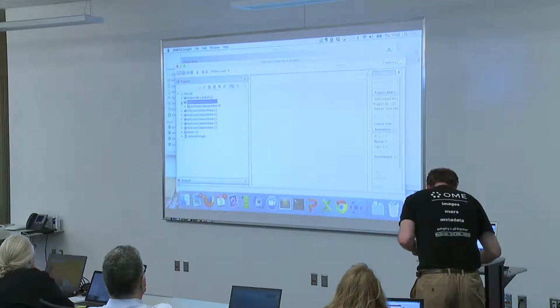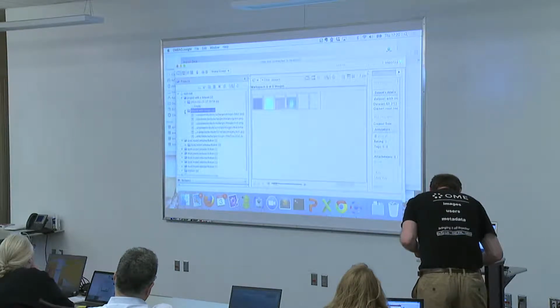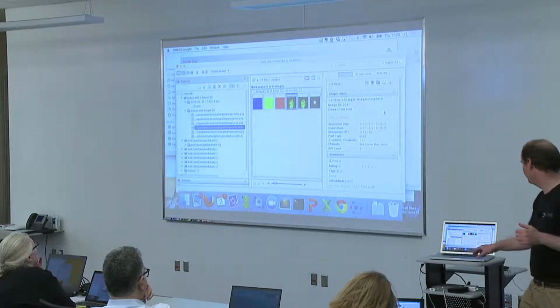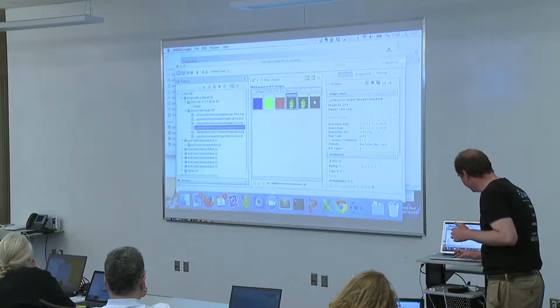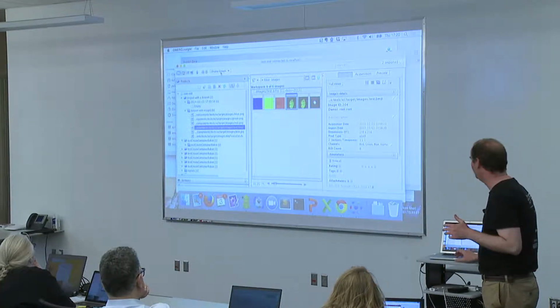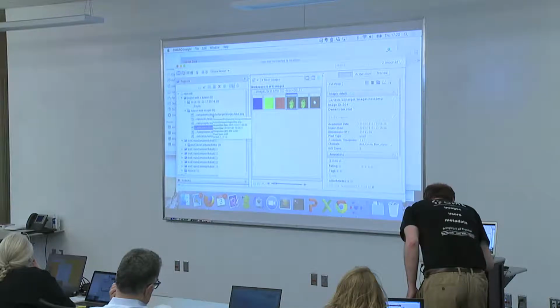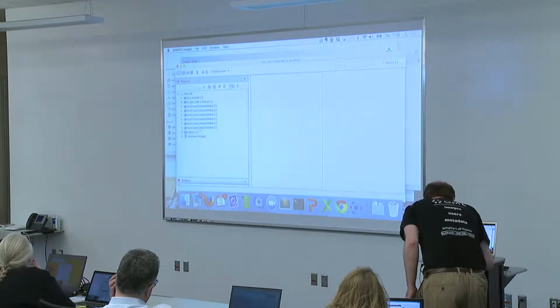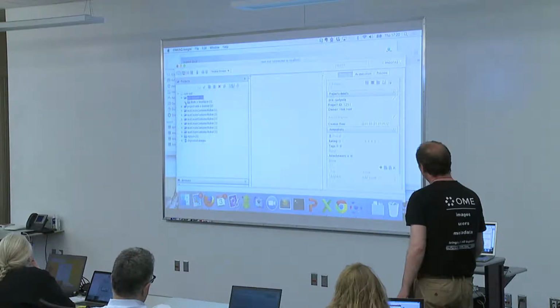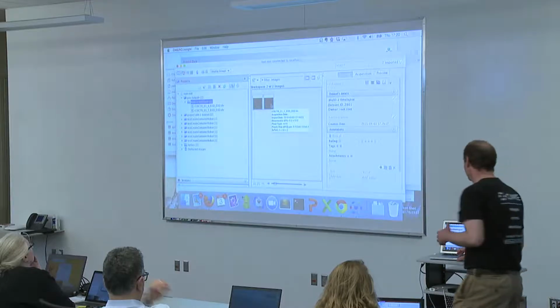If I, for example, go to an image, the basic metadata are here in the right-hand pane. When I have imported the images, I have here a tree of containers. These are the ones which I was creating on import, and the new one is just here somewhere. It's called pre-tadpole. Okay, this is the project. That's where my image went. These were two images. You can, of course, select the whole folder in the import and import the whole folder.